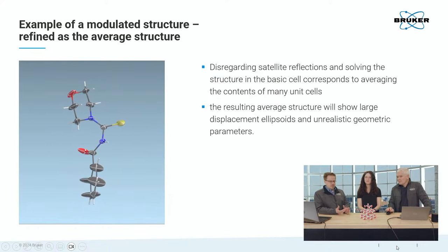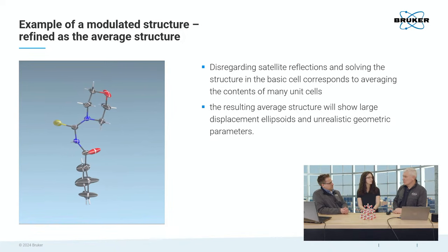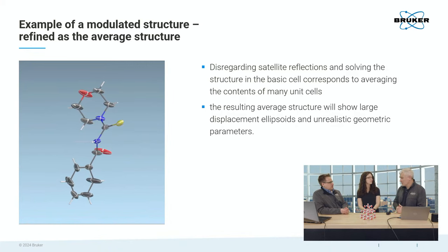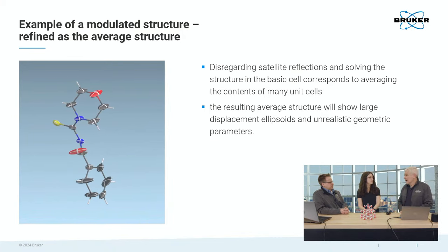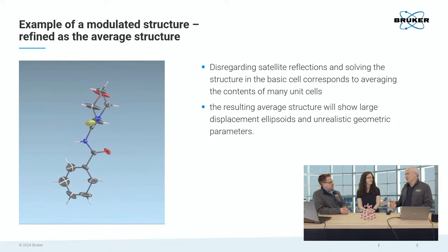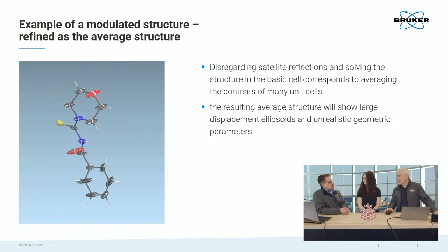So is this one of those materials that you put on the little tip and then you have to freeze it to create the crystal, or does it create its crystals on its own? No, you crystallize that. You crystallize it and you, of course, use crystallization to purify samples. So often, when we buy, because we don't make any compounds in the lab here, and we don't like to recrystallize either, so we're kind of lazy, we'll buy very pure compounds at Aldrich or Sigma, and then often we can use them out of the bottle. So at room temperature, this is a crystal.